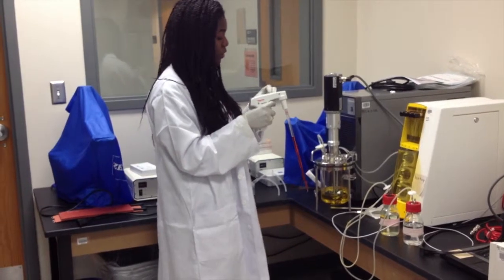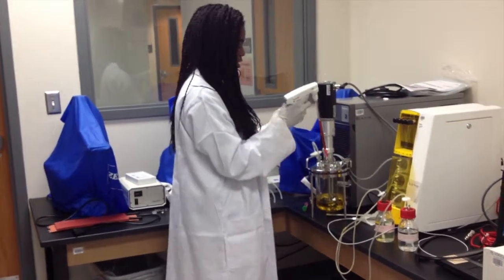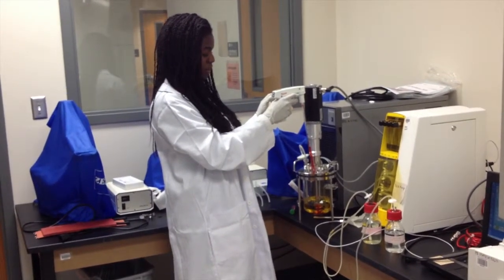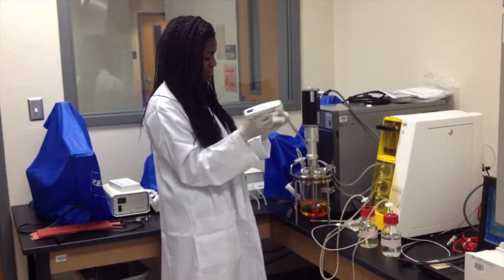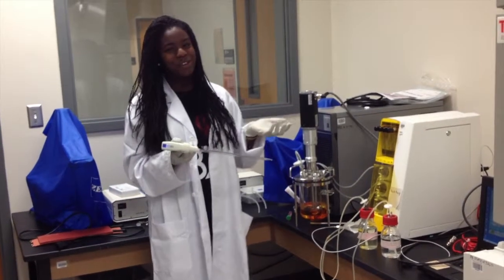And using one of our ports, we're going to put the cells in there. Because without the cells, you have no growth, just media.